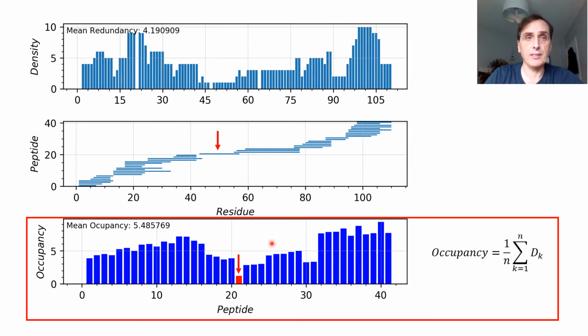And then in general, the occupancy score scales with the sort of importance of peptides for the optimization. And so because of that, if you deem that it's necessary to delete more peptides in your data in order to create subsections, then you should start with those peptides that yield the lowest occupancy score, such as those blocks of peptides that I've just put in the red boxes here.